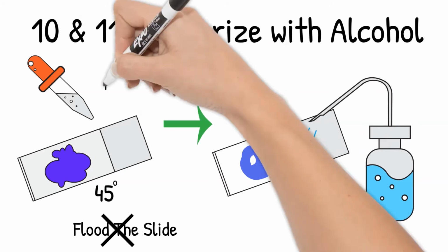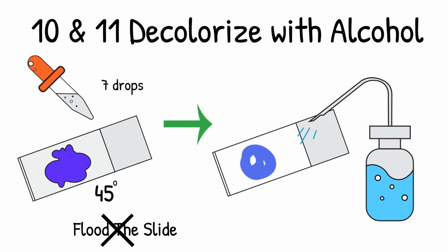I found that 7 drops do the trick, but it depends on how thick your smear is. If this is your first time doing a gram stain, 7 drops may be a good place to start. Take a look at your slide once you are done, then adjust accordingly.